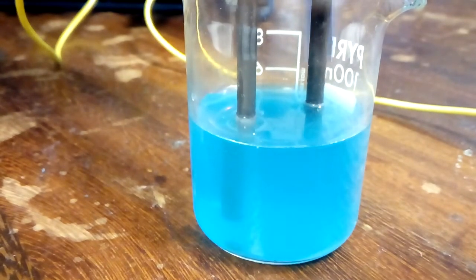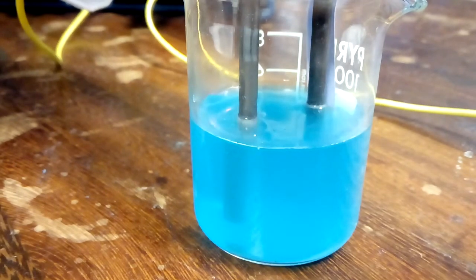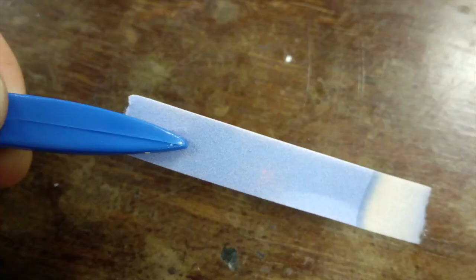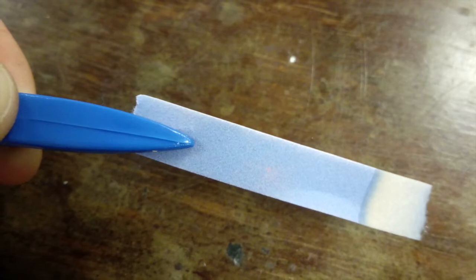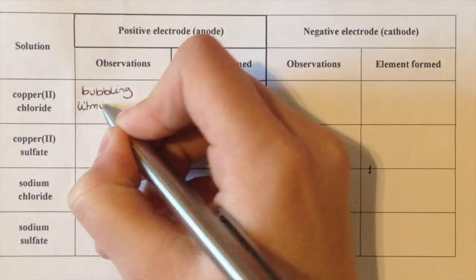With tweezers, hold the end of the litmus and dip it into the solution next to the anode. Note that litmus paper bleaches white in the presence of chlorine, but remains blue in the presence of oxygen. Record your observations in the table provided.